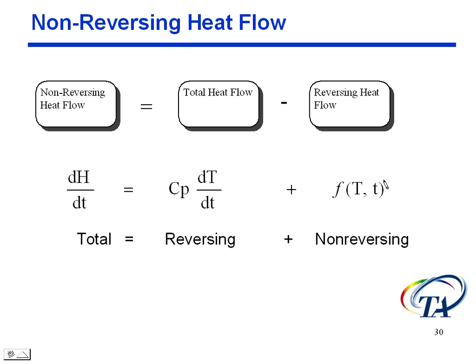What we're talking about, the reversing curve, is going to be a heat capacity component. This is what follows the modulation during our experiment. So depending on how fast we're going in that modulation, or how big a temperature range, we may see something that follows that or that doesn't follow it, as we change those conditions. So you can actually see things move from the reversing to the non-reversing curve. But anytime we say reversing curve, think of heat capacity. Non-reversing curve, think of kinetic.